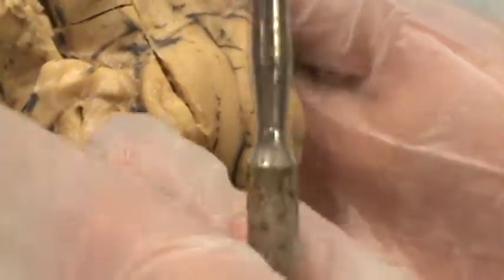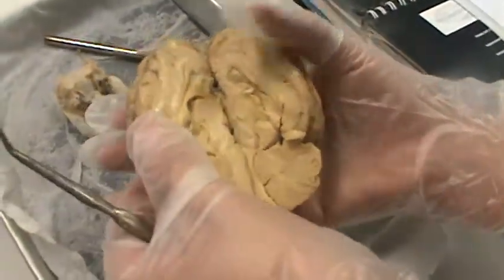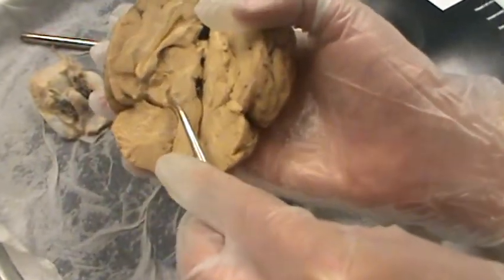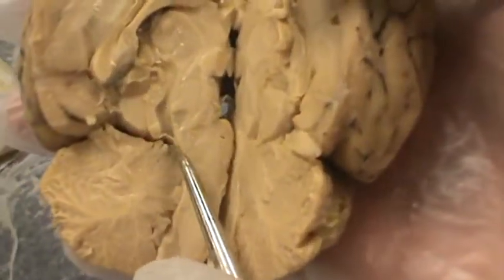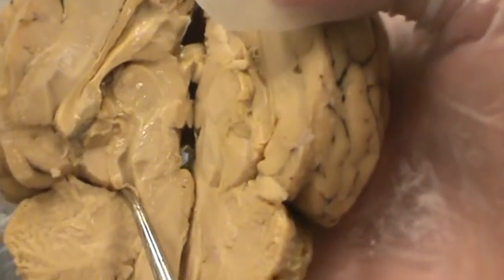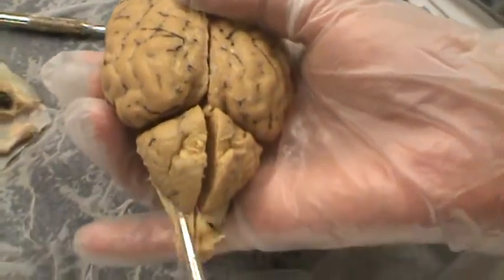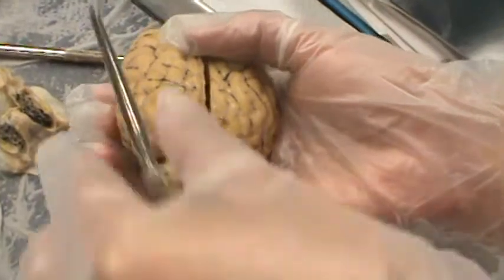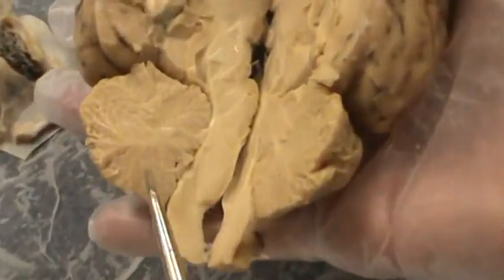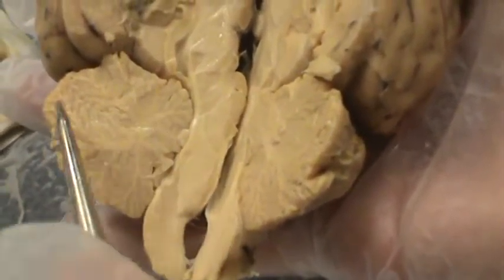The fourth ventricle is going to be between the cerebellum and the medulla oblongata, which is right here. The cerebellum is this structure. Cerebellum. And this is the arbor vitae, which is the white matter. It's a tree-like structure, meaning tree of life.